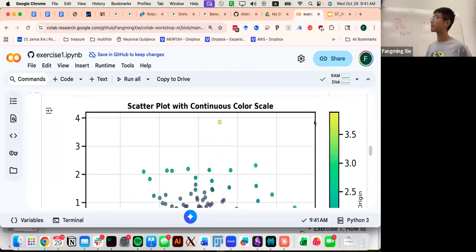It's making a scatter plot colored by a continuous value that goes from maybe 0 to 3.5. That makes sense. It's a bit chaotic, but I hope to convey the message that you can ask your question to AI. You copy the code they generated to your place and see if it works. If it works, that's a big progress.